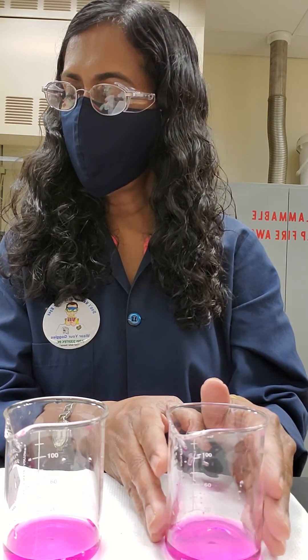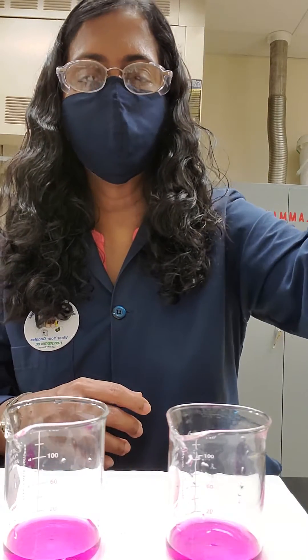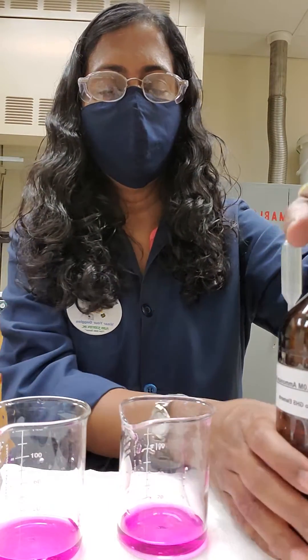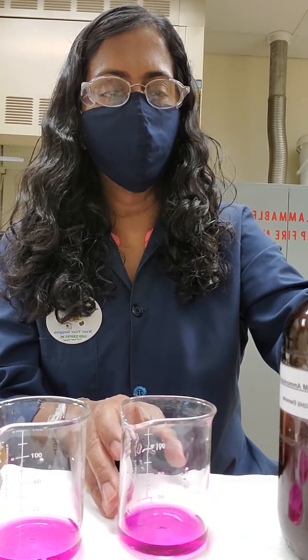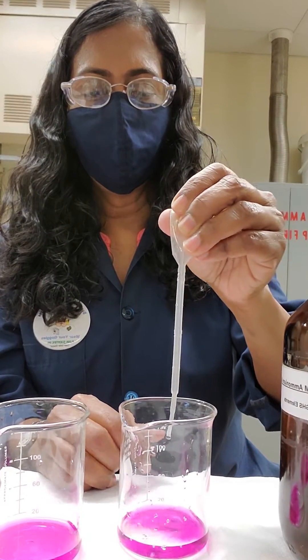We are supposed to add a solution of 2-molar ammonium acetate — we have 2-molar ammonium acetate right here. We are going to add ammonium acetate until you see a color change, so let's start doing that and keep an eye on the colors.